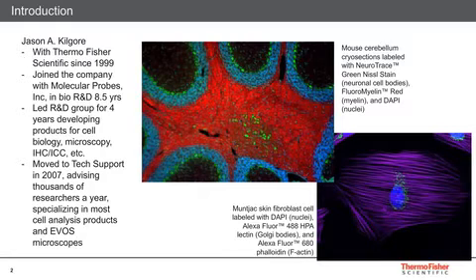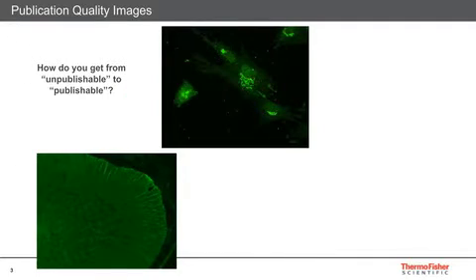And so in a given year, I talk to thousands of you, advising you on how to choose, use, and troubleshoot our products. So I'm happy to present this webinar with some of the advice I've given over the years on how to make a publication quality image. Most of the images that you'll see in this presentation are ones that I've taken over the years.